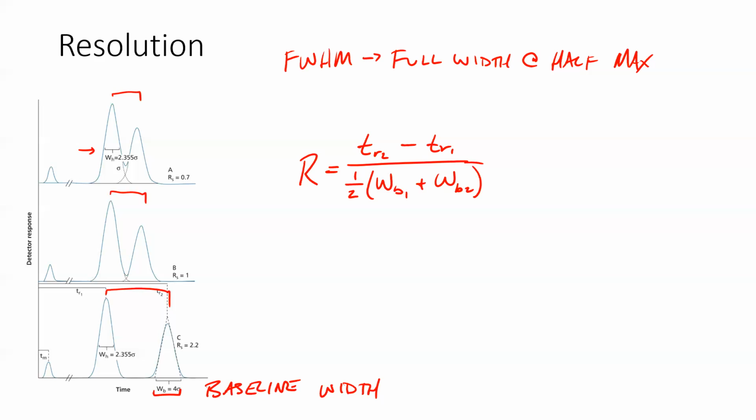It doesn't have to be super separated like this, right? If we look at this bottom option, this is separated very well. We have no problems with this resolution. But if we think about it, we're kind of wasting a little bit of time, right? This time with no signal is time that could be spent doing other things.